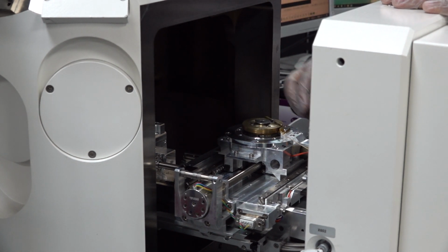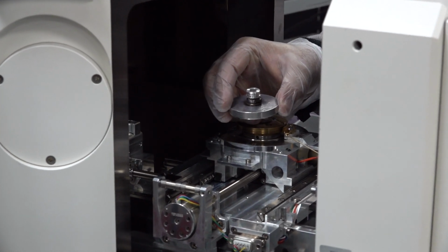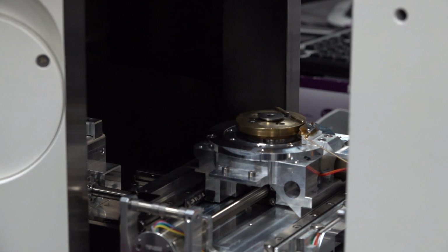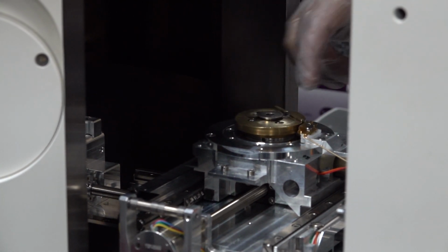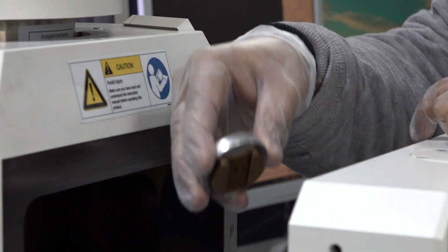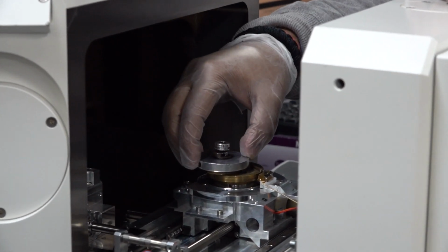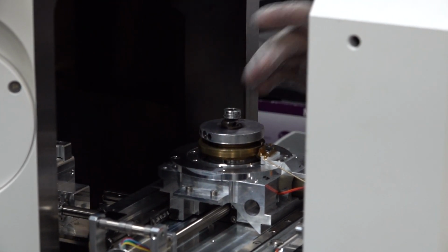Now as you can see here, I have a sample ready which I have already prepared, a gold on carbon standard sample. You can see that there is one stopper line here, and there is a circular thing. You can see that there is a groove here, and then you just have to push this from the other side of the line and make sure that the stopper line has been hit. So now the sample is set.